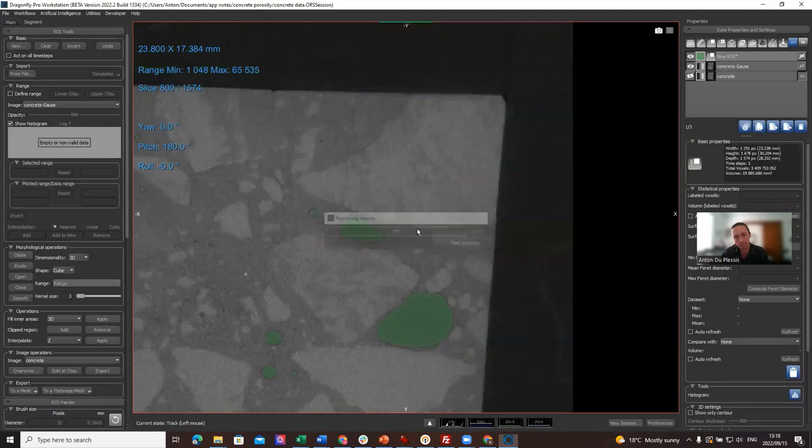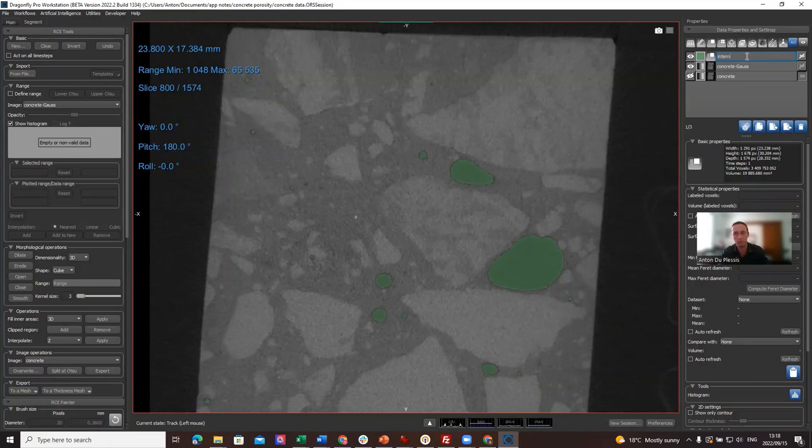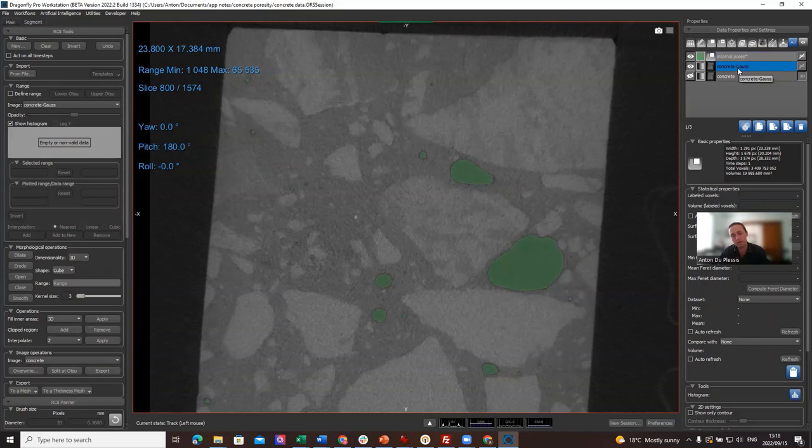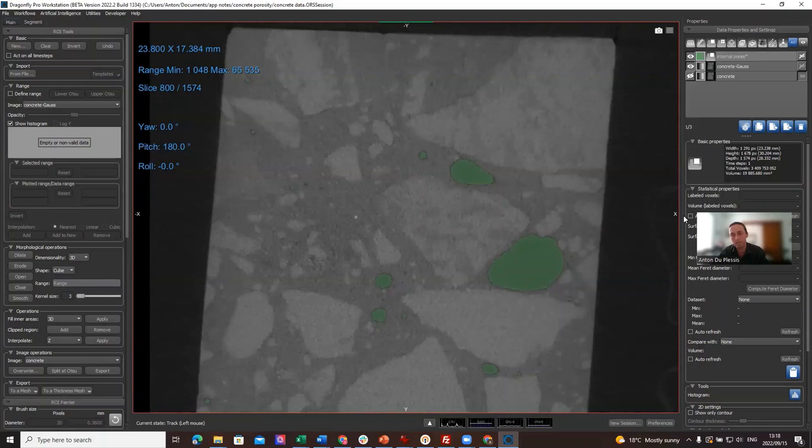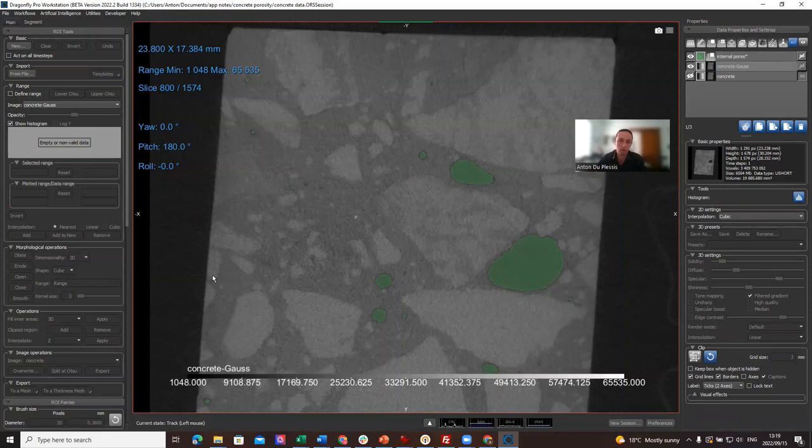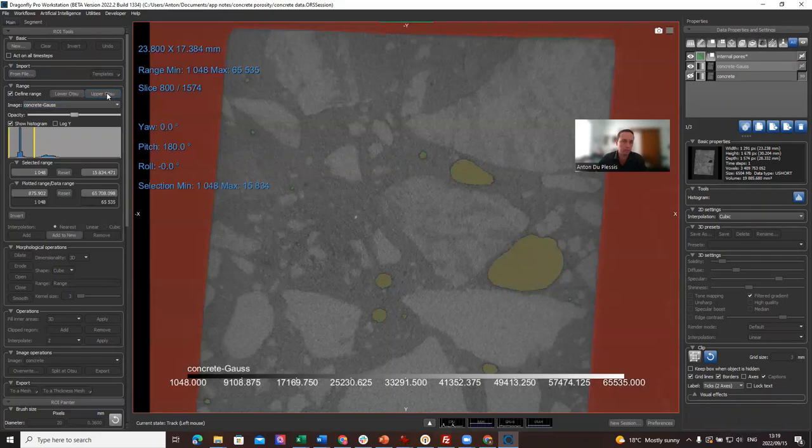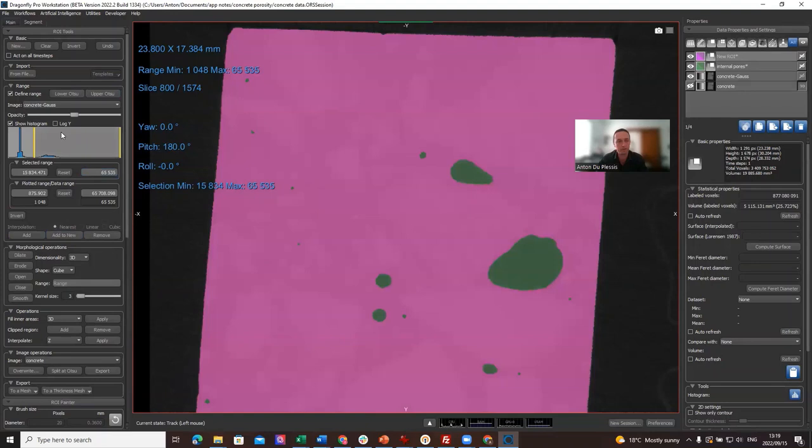So we can call this Internal Pores, just so we don't get mixed up. Because typically at this point you want to know what percentage of the material does this make up, what is the percentage of porosity. So for that we also need a reference. We need to know what is the volume of the total material. So go click back on the image channel and make a new region again, in this case Upper OTSU. So if we add, make a new region of interest of that—these colors are selected by default, by the way, each time different—so this would be the total sample.